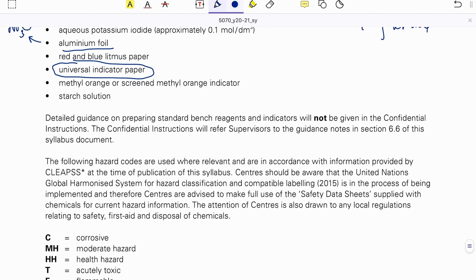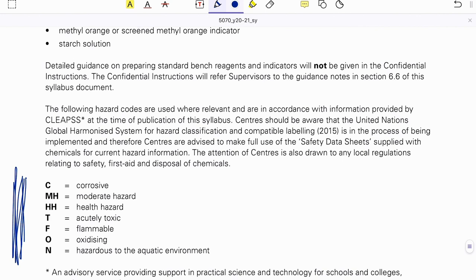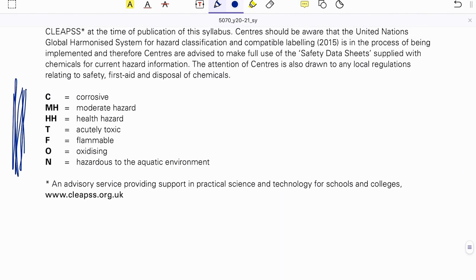some pictures and videos of. All right, these are all common hazards of chemicals. So just because you do experiments does not mean that you shouldn't be aware of all the dangers. So acids are corrosive, certain stuff are toxic, oxidizing agents are obviously oxidizing, alcohols are flammable, etc. Okay, I've gone through that syllabus now. So now I will show you some videos and pictures that I gathered from my friend, Mr. Maxim from PT Sungkurong.